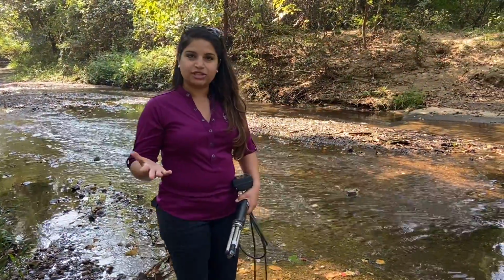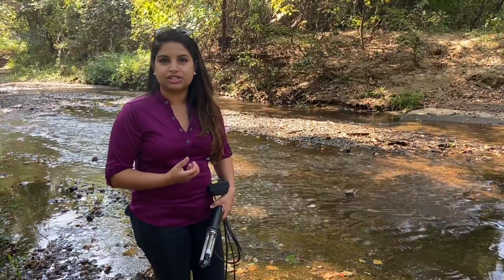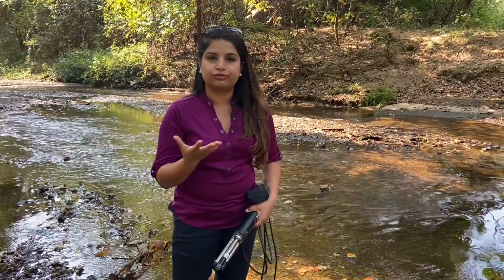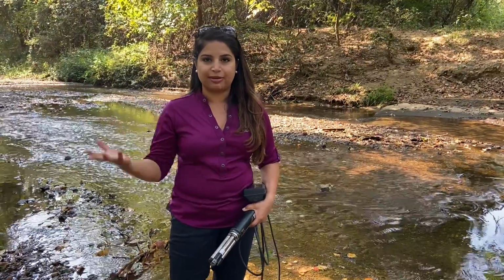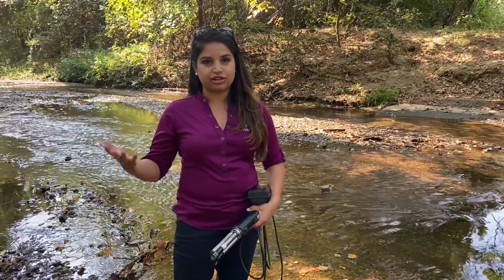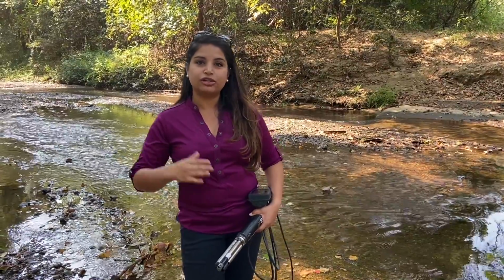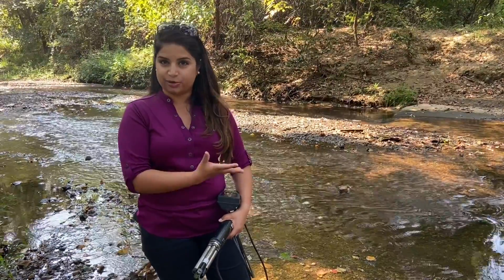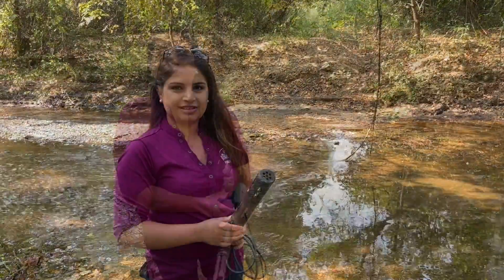So the first thing we do when we reach a sampling location, we look at the color, the odor, the turbidity, and look if we can find any floatables that are abnormal for that location, and we write down our observations in our logbook. Then we move on to the second part of the dry weather screening, which is to measure chemical parameters in the water body.